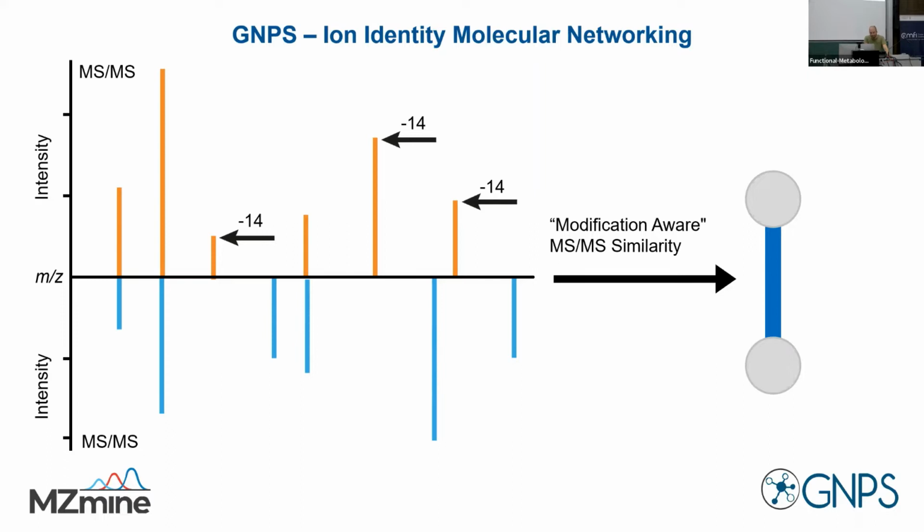Because I feel like, well, you could say, well, they all have carbon, so they are closely related, right? Yeah. But also, do I have any influence as a user on that? Yeah, that's a very good question. Thank you. So there were a couple of settings yesterday in this molecular networking job that we submitted that we did not really question, right? We just left them default.